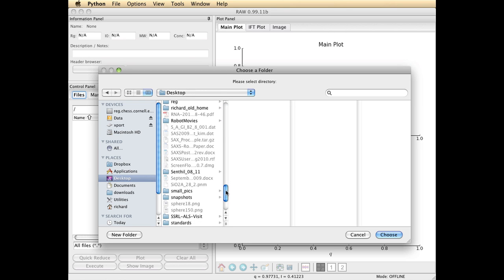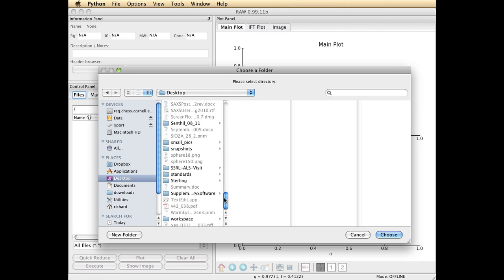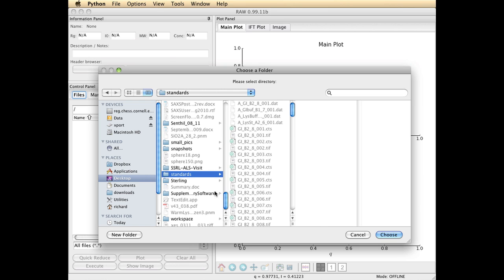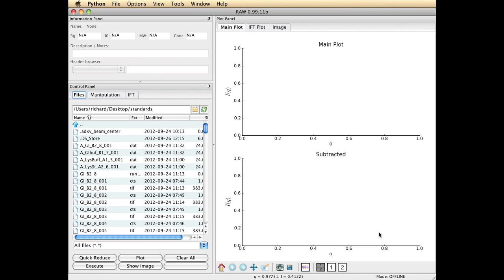My data is located on my desktop and it's called standards right here. So I choose that folder and you'll notice that a bunch of files have appeared in that folder, all the files.